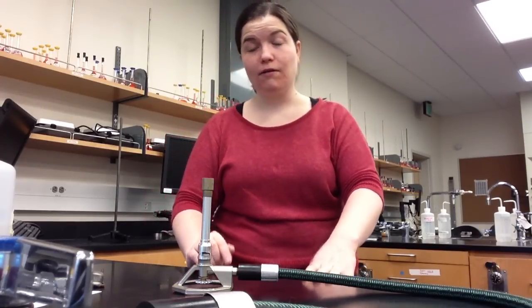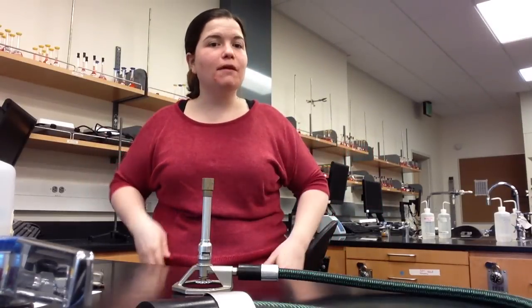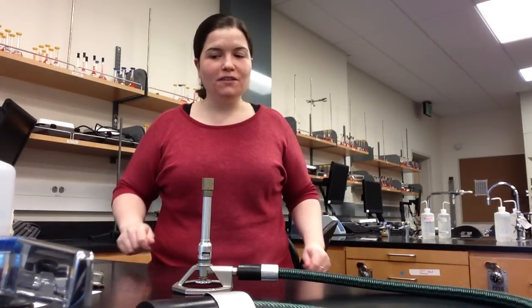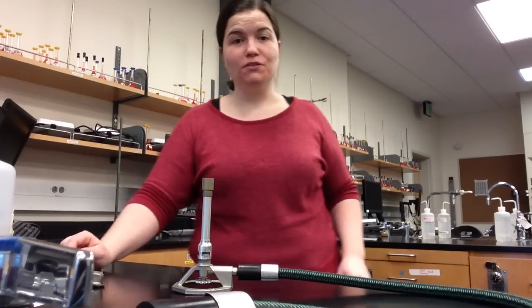Before I turn on the gas, I want to make sure long hair is tied back and any strings that might be on my clothing are tucked away, and any loose pieces of paper have been pushed to the side.